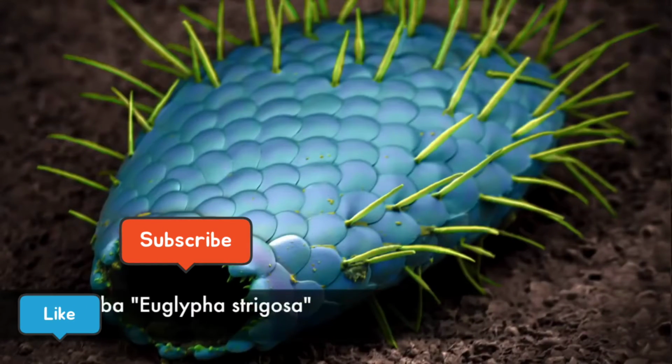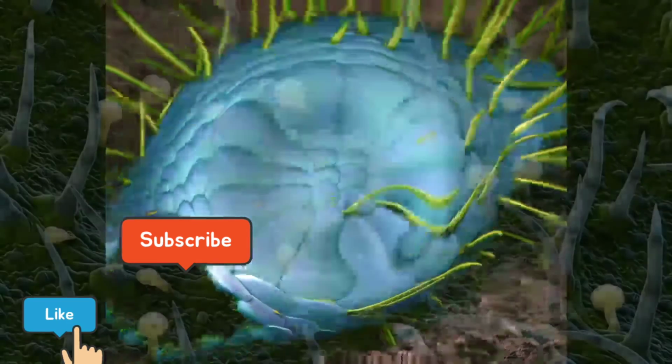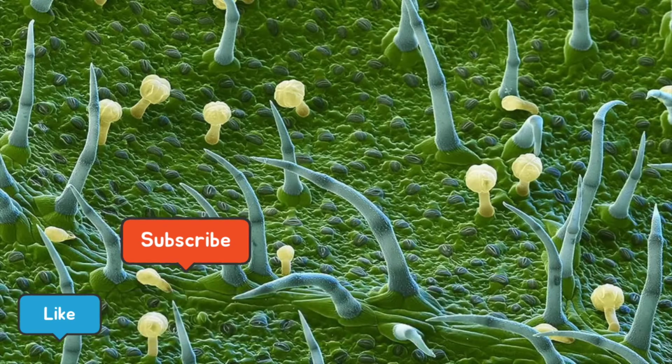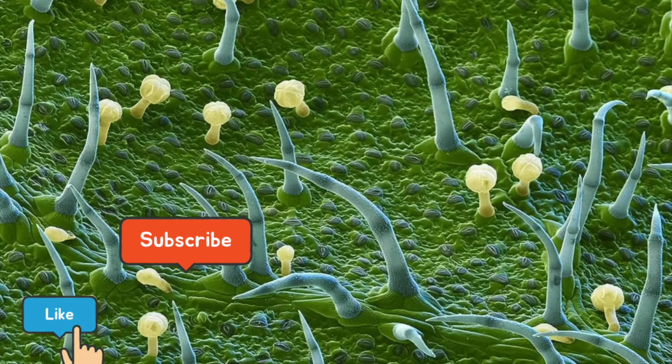Euglypha strigosa, an amoeba which builds its shell with self-secreted silica plates and spines. A potato leaf surface covered in hair-like growths called trichomes. The long spiky trichomes protect the plant against predators and water loss through evaporation. The rounded trichomes secrete oils that are irritating to predatory insects.